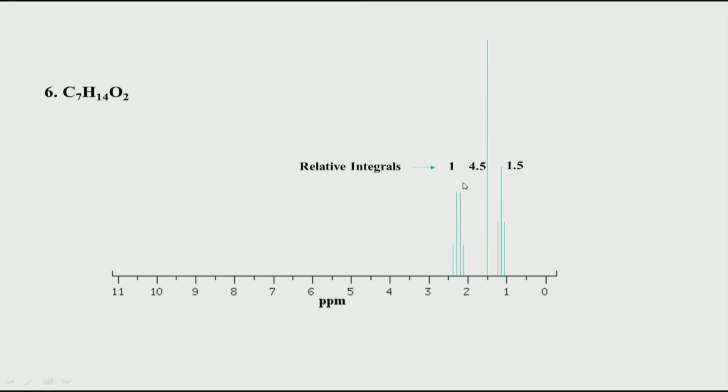Now, the question is how do you interpret this integral which is fractional. Remember, as we saw in the last class, in NMR all you get is what is called relative integration. Unless you take a reference and then quantify, you will not get the absolute value, but if you look only within this spectrum, within this molecule, it is only a relative value which you will get. So, then one has to take a judgment on how to analyze this.